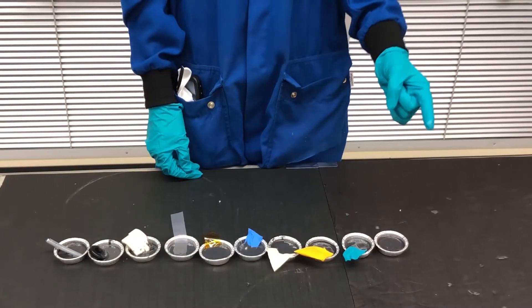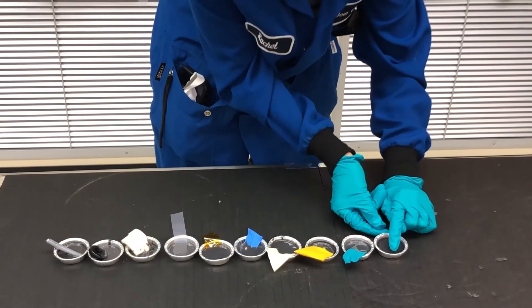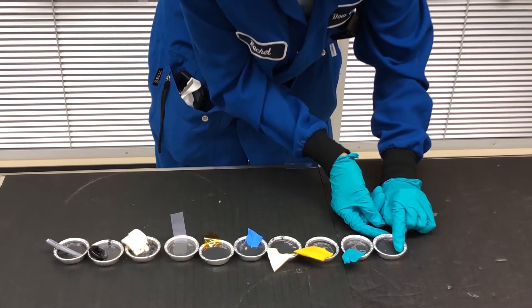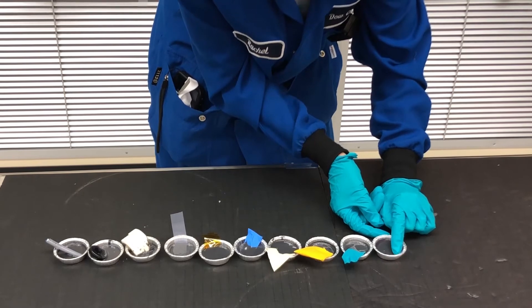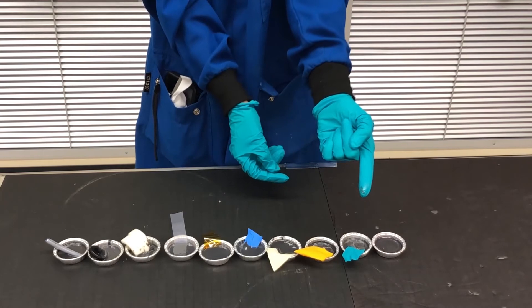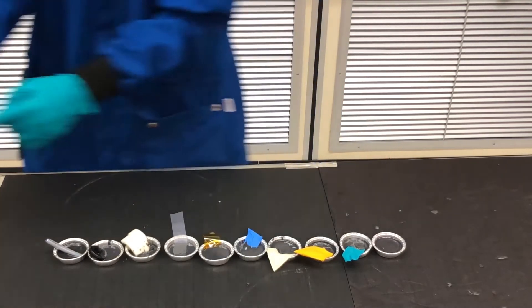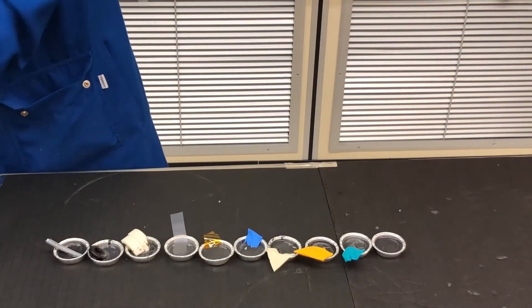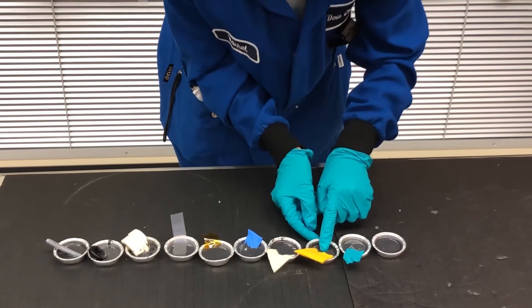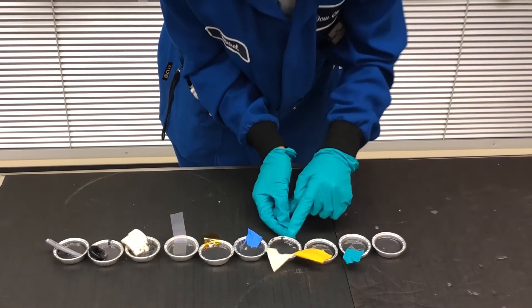Once the target cure time is up, come back with a gloved finger and press on each sample to make sure it's cured and tack-free. Check your glove after each sample to see if any residue comes off the sample. If you pick up residue, that's a good early indication that cure inhibition is occurring. Wipe off or change gloves, and then come back and continue to check each sample.